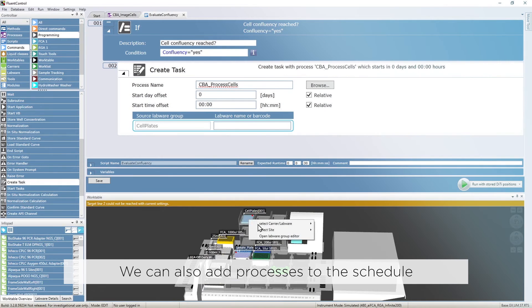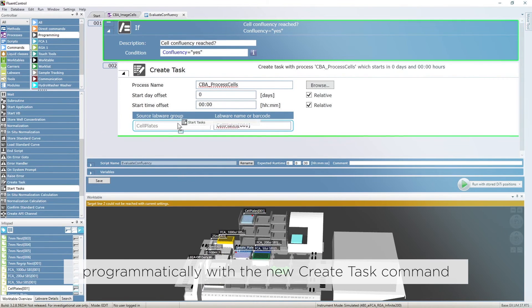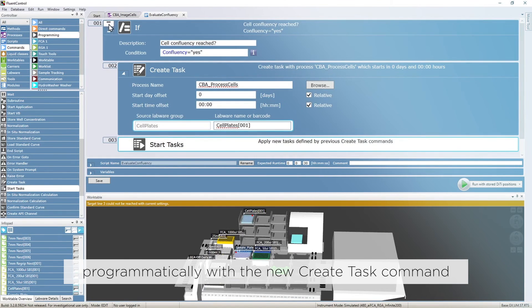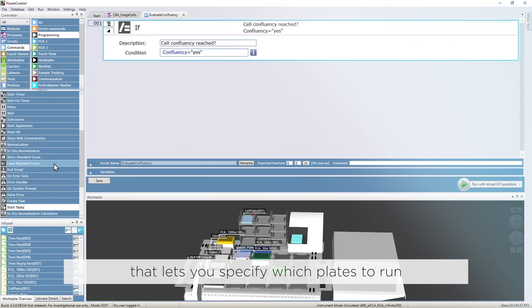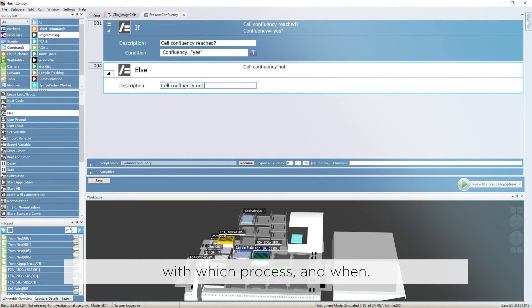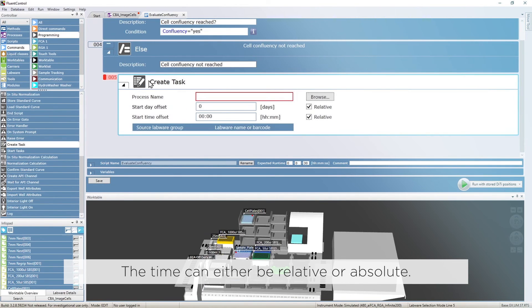We can also add processes to the schedule programmatically with the new AddTask command, that lets you specify which plates to run, with which process and when. The time can either be relative or absolute.